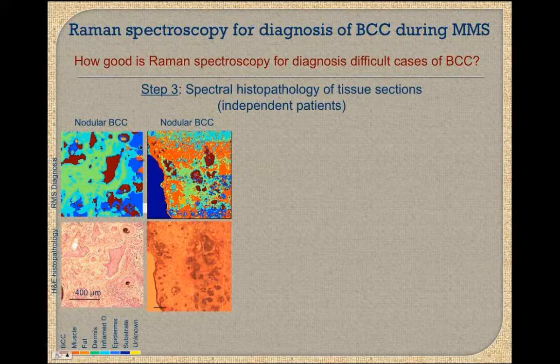In this case here, also very good classification. Every small tumor region is detected. What's also interesting is, because the specificity is not 100%, sometimes we get some false positives around these hair follicles in some cases. Now, for other types, like infiltrating BCC, showing two examples, you can see tumor regions down here are all detected. Again here, they are all detected with the right labels. They are labeled as BCC.